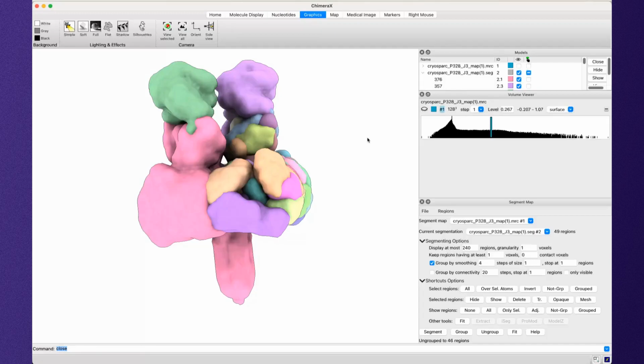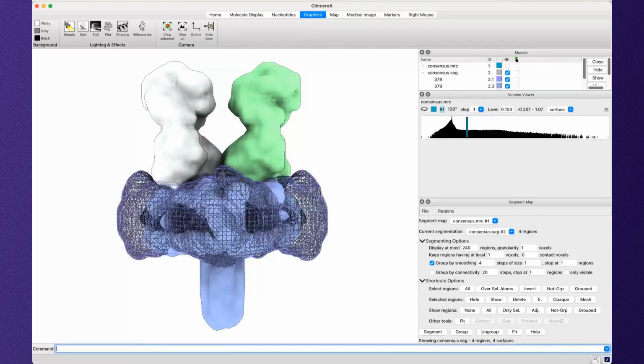And then I will put up my finished segmentation so that you can try and get yours to look kind of similar to this, at least for your own target. This is what my final segmentation looks like. And you can see, just as I described, I've got one segment that covers this right-hand fab, one segment that covers this left-hand fab, and of course, that's just in this view. It's just one fab in the other fab.